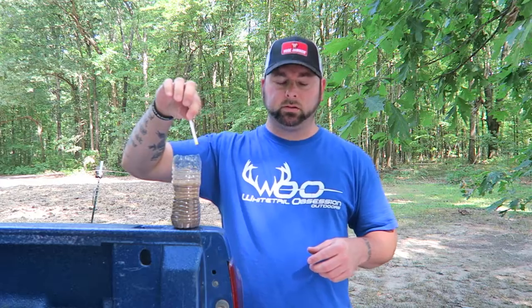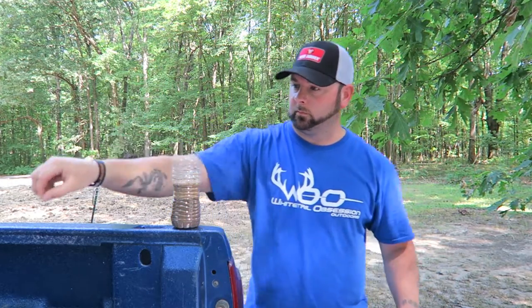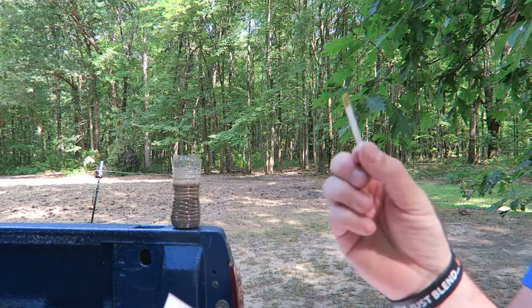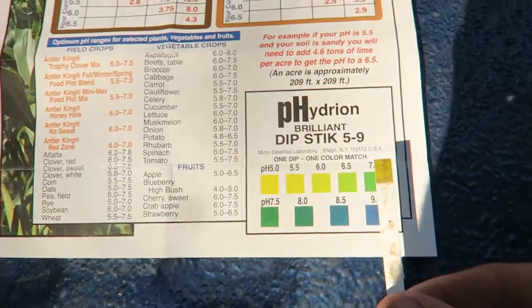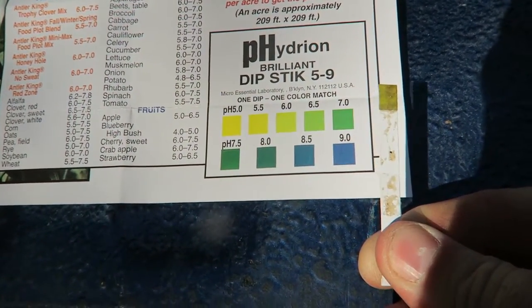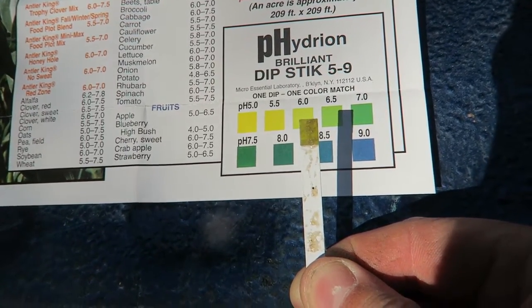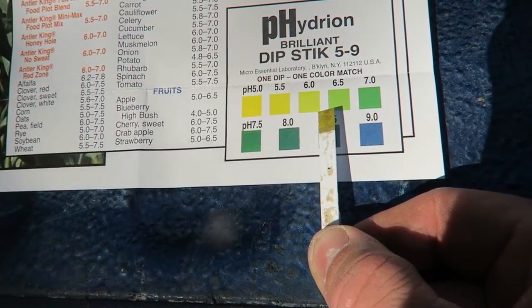It's been 15 minutes, everything has settled down. Here's our strip — we're going to dip it in, shake it off, and then compare it to the chart that came with it. Here are our results. Looking at the lighting, it doesn't look like it's anywhere close to where it should be.